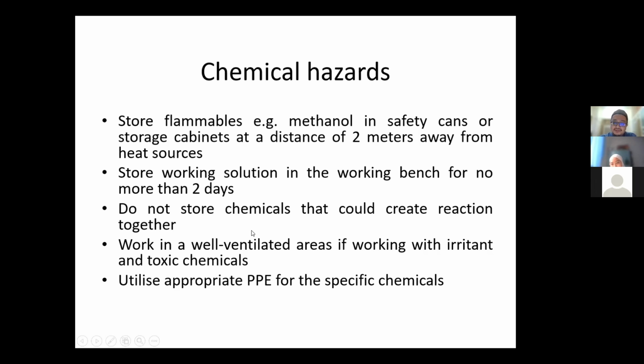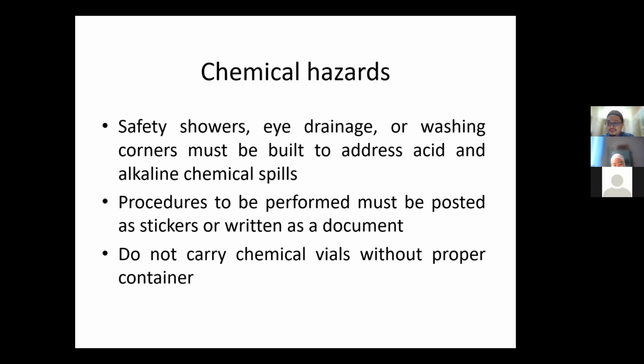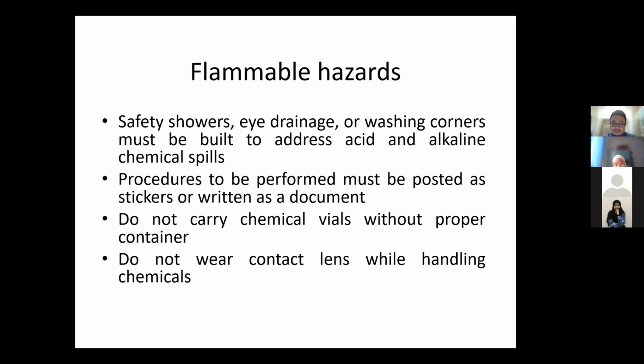Do not store chemicals that could react together, in case there is leakage that we do not know about. Work in well-ventilated areas and with proper PPE. I have said proper PPE so many times already. Safety showers, eye drainage or washing corners must be built to address acid and alkaline chemical spills. Did you notice our lab has this? There is a shower at the front, on the right side. Procedures to be performed must be posted as stickers or written as a document, and do not carry chemical vials without a proper container. Okay, that is chemicals.